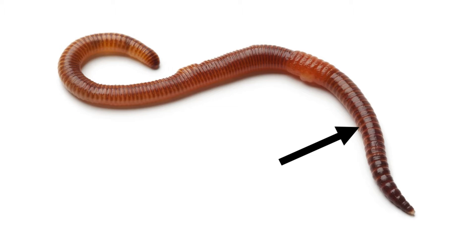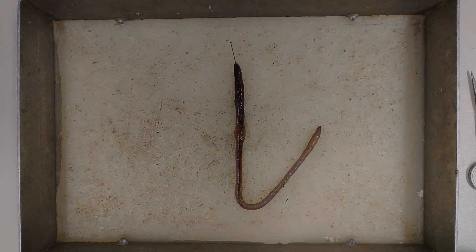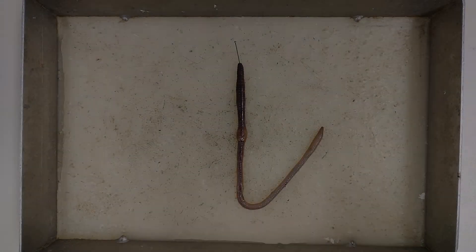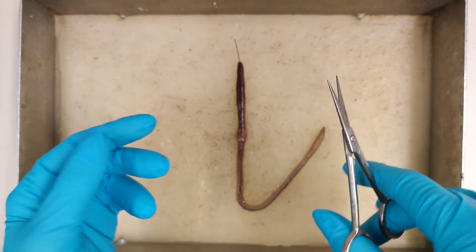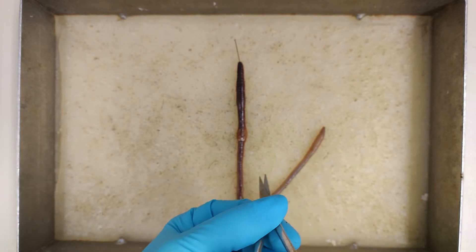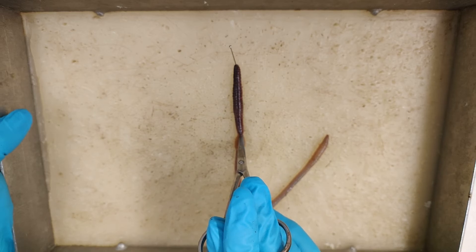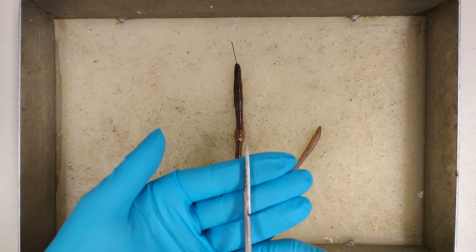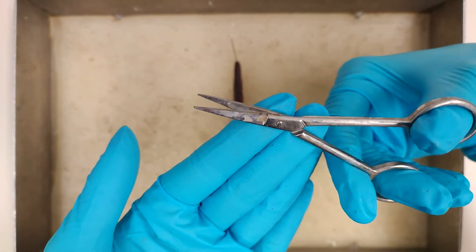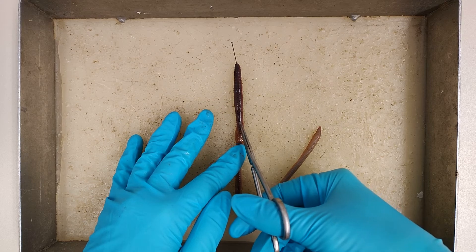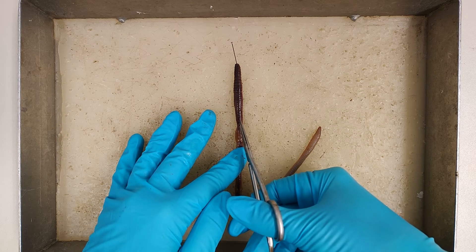Only the part above the clitellum — that is, the front end of the worm — is prepared. The worm is placed either on its ventral side in the dissection dish, or held in hand. The first cut is made with fine scissors horizontally through the body wall above the clitellum. Gently squeezing exerts pressure on the worm, which makes cutting easier. The scissors are then inserted vertically into this incision in order to cut the worm up to the mouth opening. Make sure that the scissors are angled slightly outwards in order to avoid injuries to organs in the preparation object.